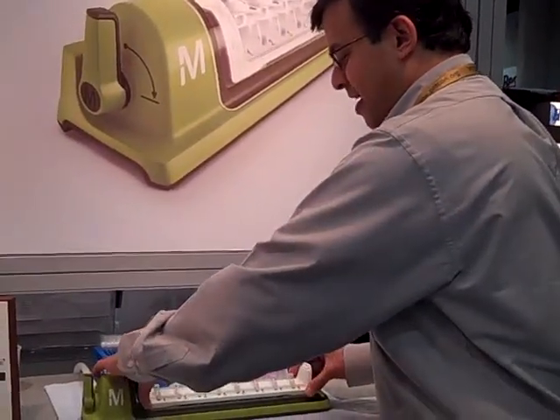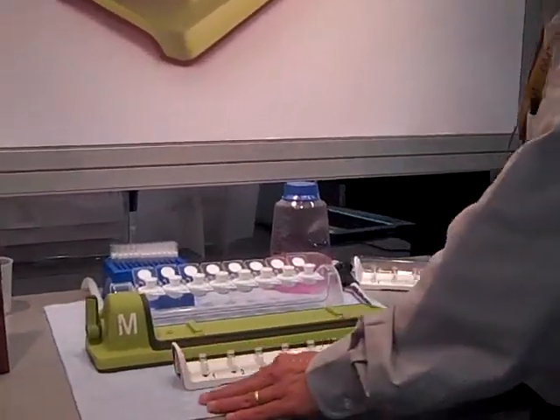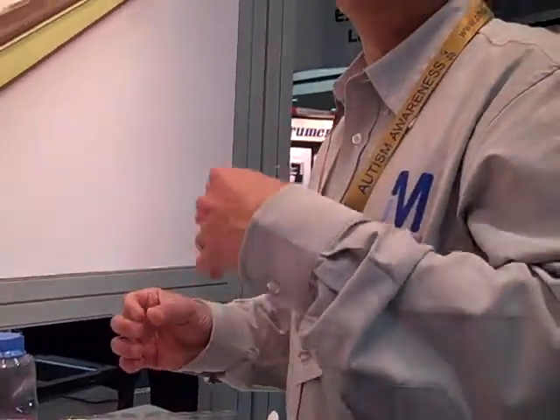Just to give a brief idea as to how this system works and why it has become a big hit — talking a bit about syringe filtration, where people do single samples at a time using a syringe and a syringe filter attached to it. It's a manual process, it's a tedious process, and it can take a lot of pressure with manual, repetitive motion.